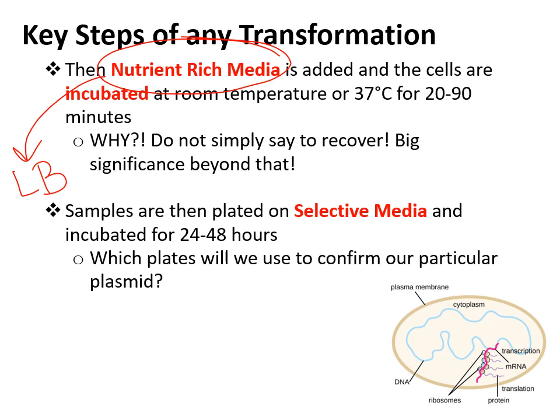Specifically, in our case, it needs time to make the beta-lactamase and the beta-galactosidase, okay? So if you do not incubate in nutrient-rich media, then in the later steps, when you have antibiotic on some of the plates, you will kill the bacteria whether it has the plasmid or not.